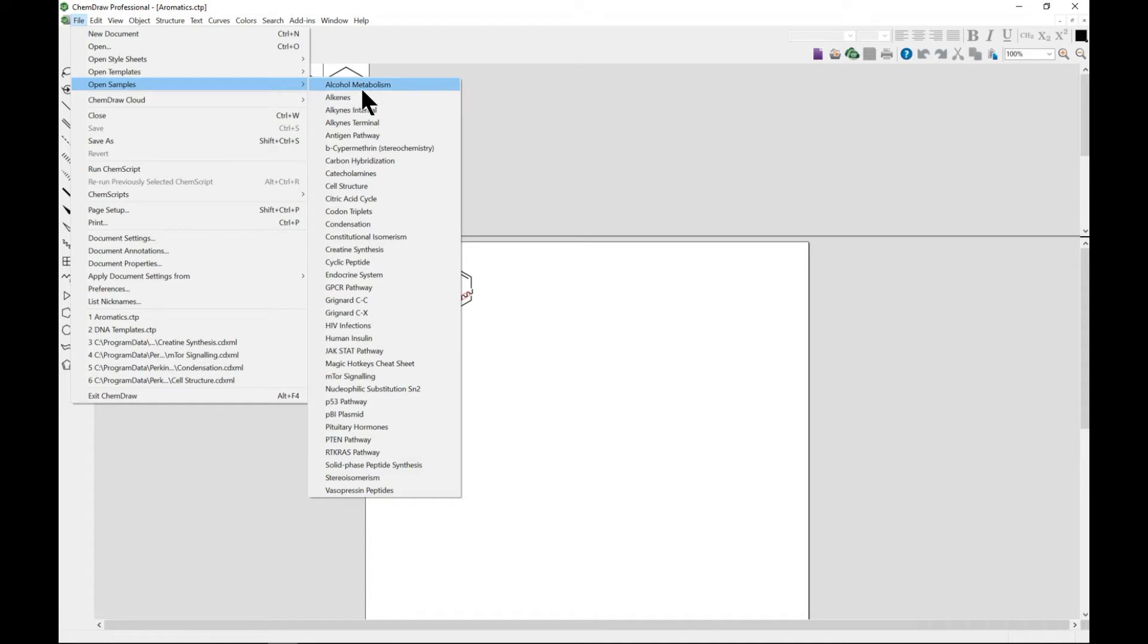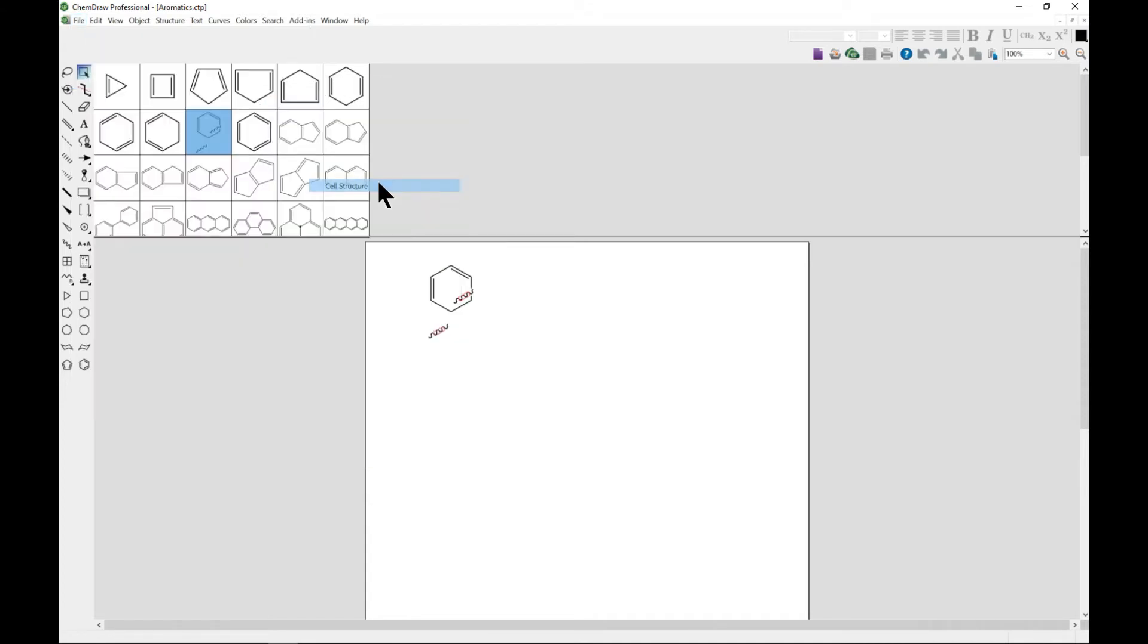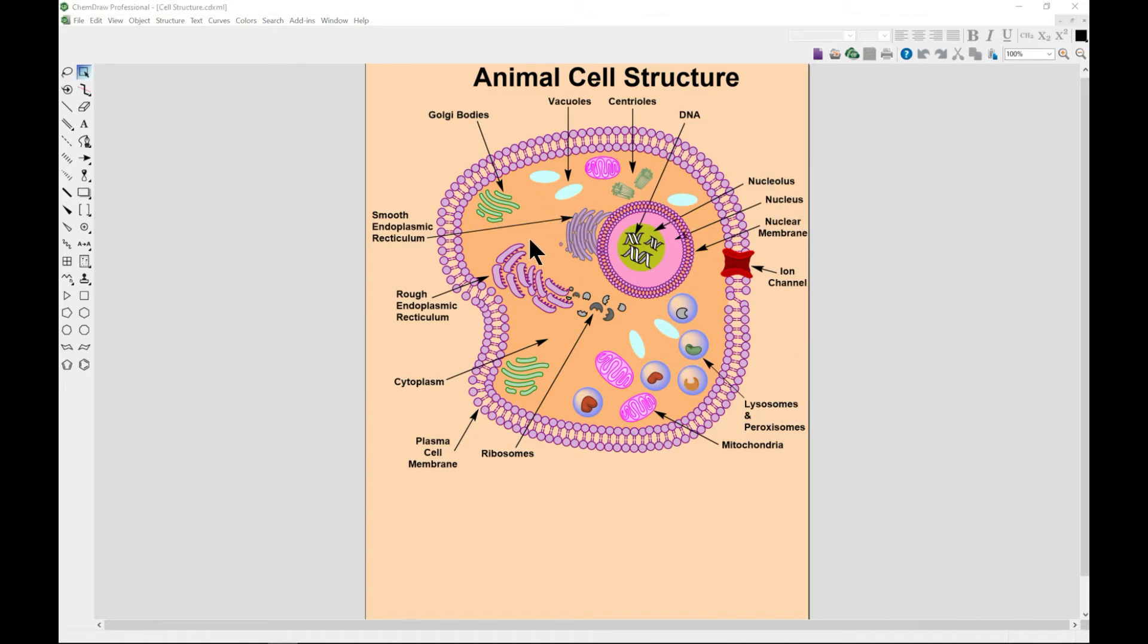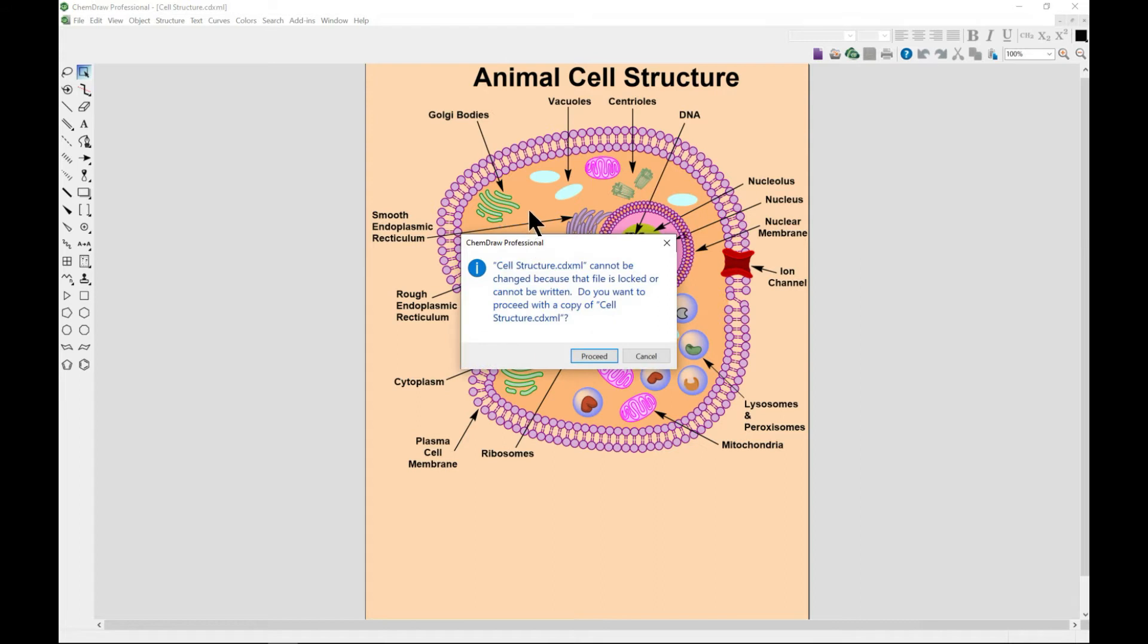For instance, if you want a cell structure, this is it. It already gives you designs in a real formatted way. You can come in and also edit it.